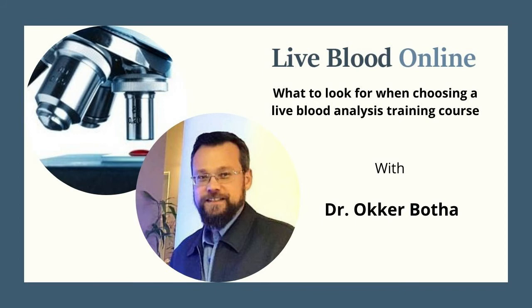It's not simply a case of just placing the sample on the microscope and then looking at it. There's a very specific procedure in how to choose where you're going to look at a sample and how to actually assess the sample before analyzing it, to decide where the actual information that you're looking for in the sample is actually available, where you actually need to look to find that.